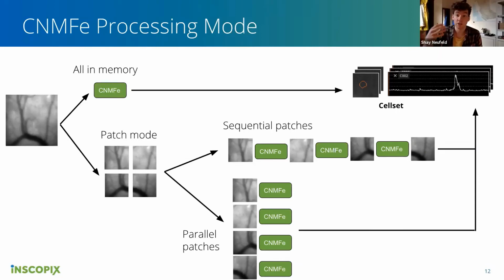So think about this: we're dividing the movie. We're trying to recreate the movie by estimating the neural signal, the background, and the noise. So you start with 1 movie, but now we have 3 movies: neural signal, background, and noise.